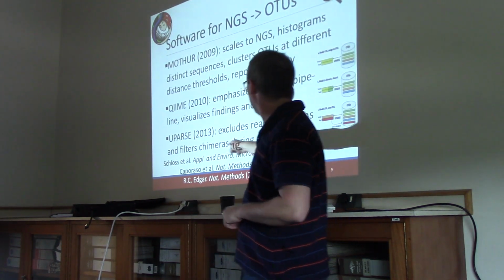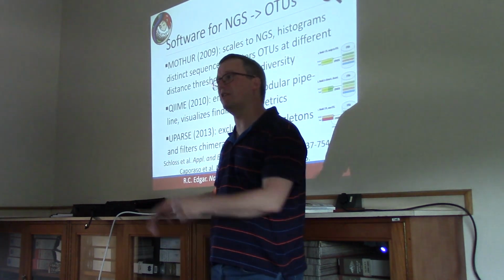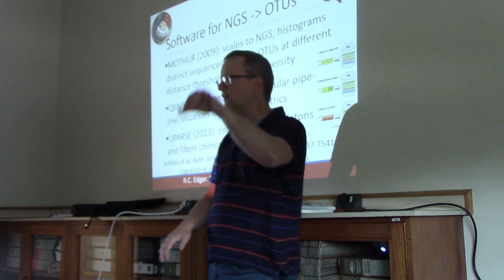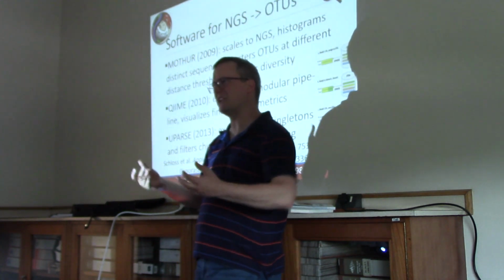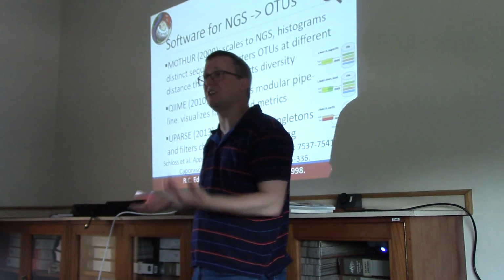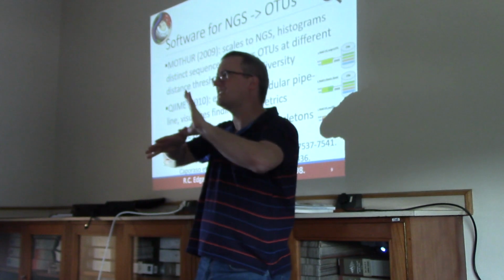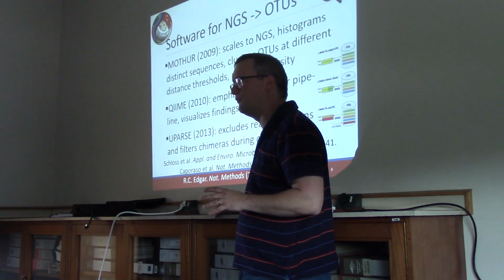It's okay. So we could imagine then that you might, through this weird PCR reaction, have produced a sequence that combines the V1 back half of one species and the V1 front half of another species. So that might seem like, so what's the big deal? That's just a weird thing and it happens. But when you're trying to cluster together sequences, chimeras like that can cause this OTU and that OTU to get stuck together erroneously. So being able to filter out chimeras is actually quite powerful.